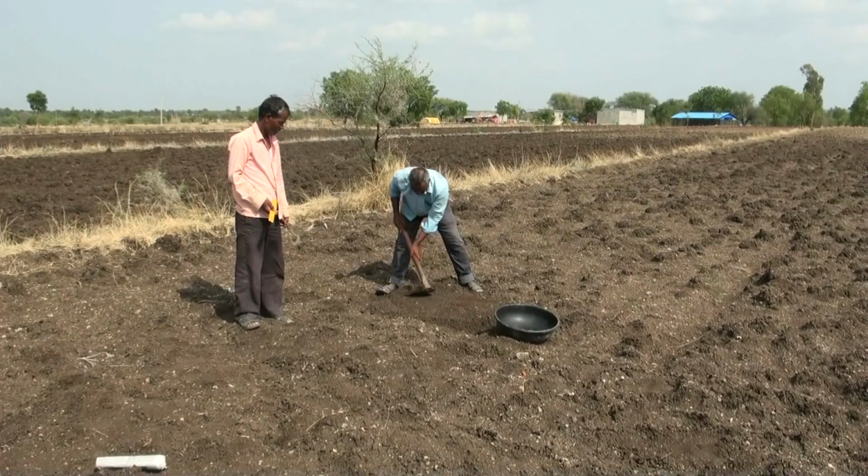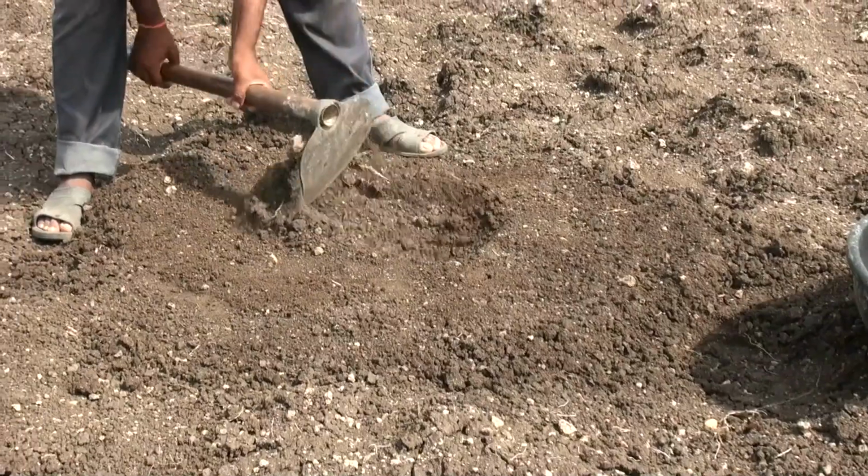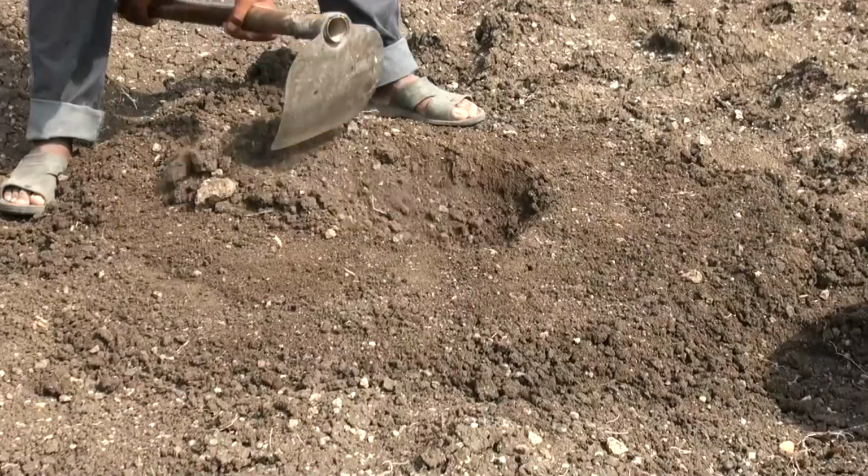In order to collect soil sample, remove surface litter like roots, stones and grass from sampling spot.